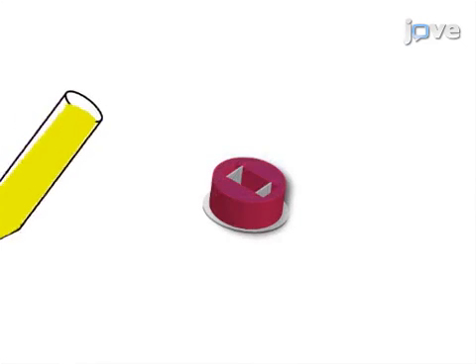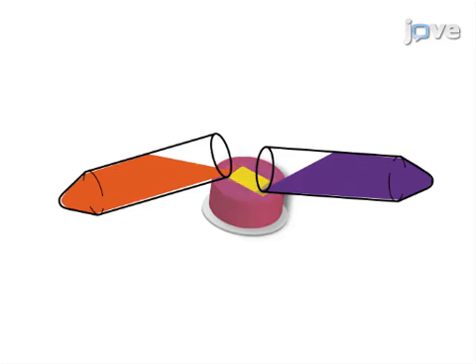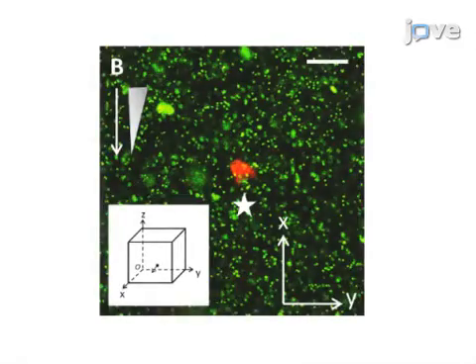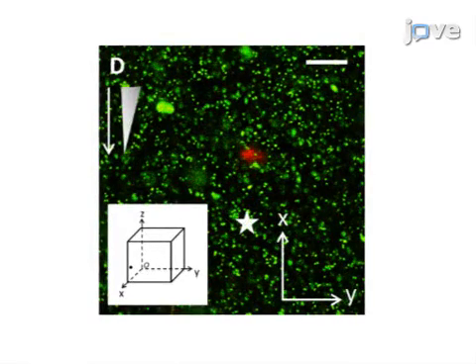Next, the collagen cell mixture is added to the center compartment and allowed to polymerize. The final step is to remove the hydrophobic cover slips from the mold after incubation and to add plain media to one reservoir and media with chemoattractant to the other reservoir. Ultimately, confocal microscopy is used to track cell chemotaxis over time and visualize cell motion displacement within the collagen matrix.